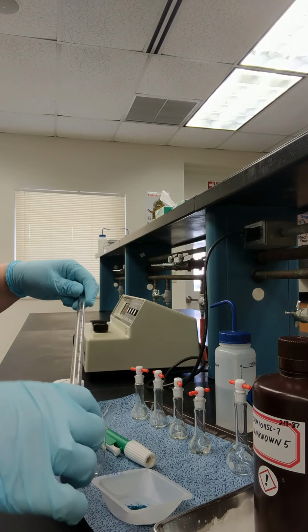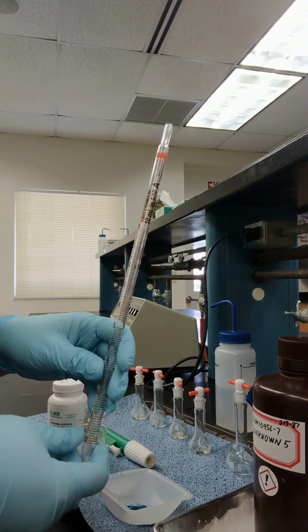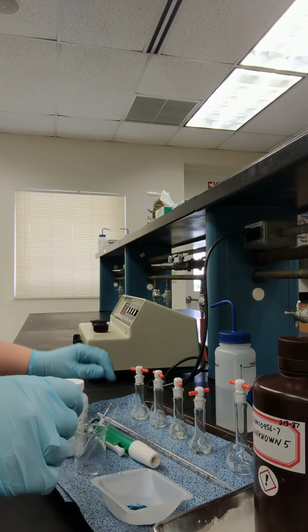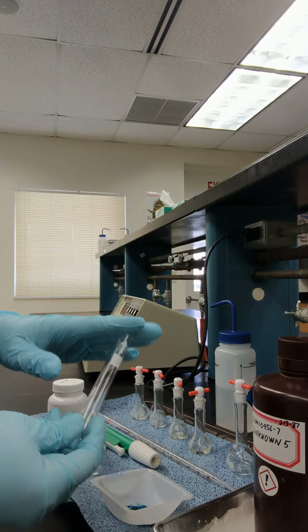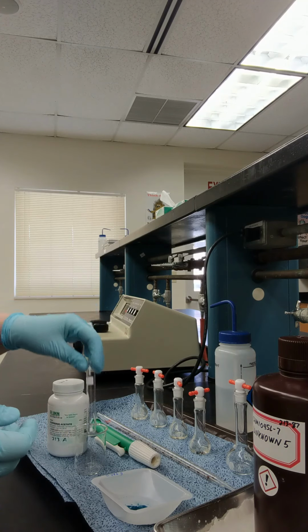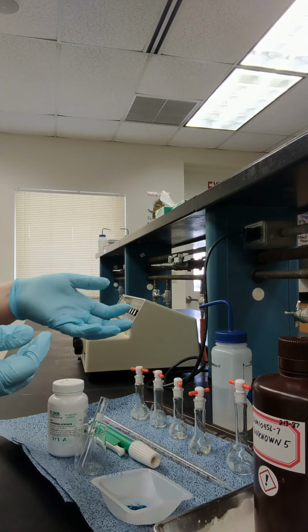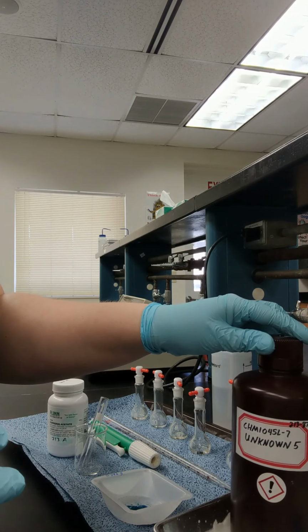Other things that we need is first the pipette. With this pipette, we're measuring the volumes that we're using from the stock solution to prepare our dilutions. The pipette ball. And lastly, we have the cuvette that we're using with the spectrophotometer to measure the absorbance for our samples. The spectrophotometer is already set up and calibrated using distilled water, which is going to be the solvent for our solutions. The last thing that I have here is the unknown solution that we're using.